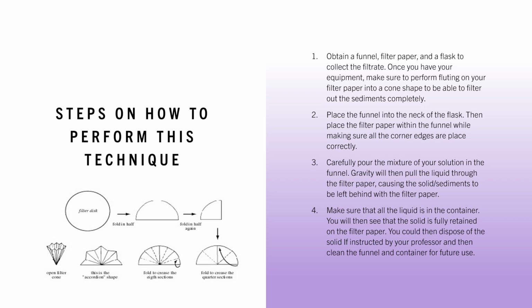So here I show a display on fluting. So you want to get a filter disc, and then you want to do these folds, in which me and my group struggled with during the water purification lab, which took a long time, such a hassle. So then once you complete fluting, you'll be able to filter out the sediments completely.